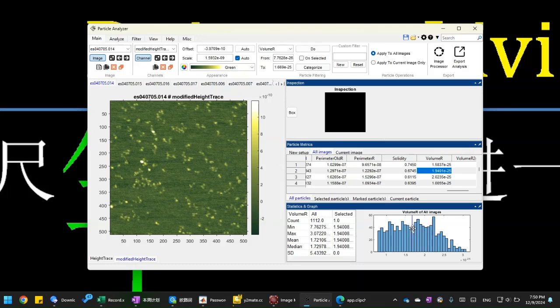So what it does, it places a vertical bar here indicating where the upper range of the volume is. And the lower range is from the minimum. You can also verify that from here in the filter section. So from the volume filter, right, the upper range is 1.6 e to the minus 25. That's where the blue bar is. The lower range is the minimum of our volume.